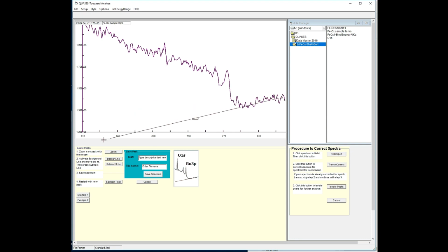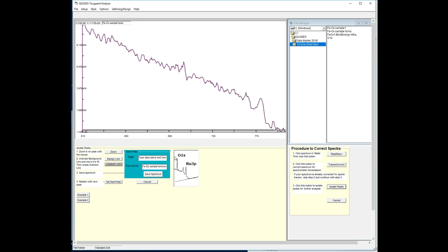So that'll be something like this. It's not too sensitive to whether I put it like this or like that, a little bit further down. You could do this as an exercise. This would show you what is the uncertainty in the analysis, and it's smaller than what you might think. But we remove the line again up to here and subtract the line, and this is the spectrum.